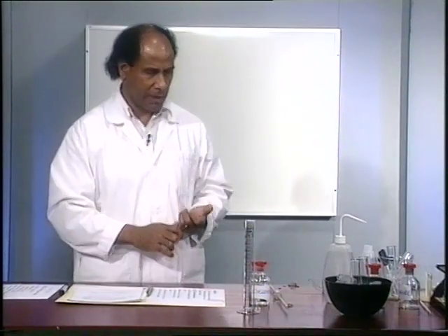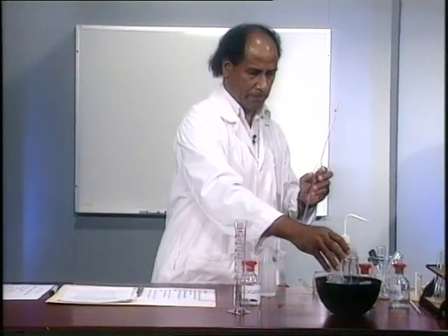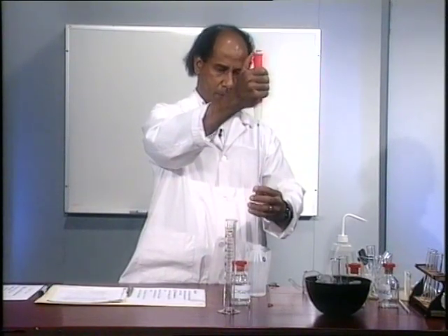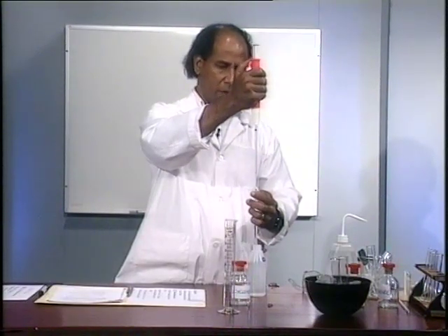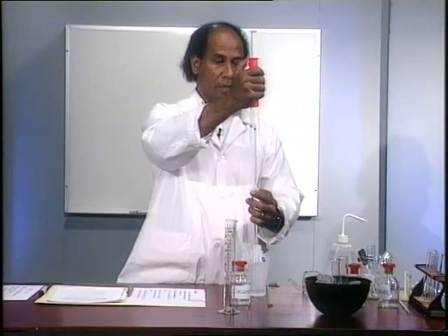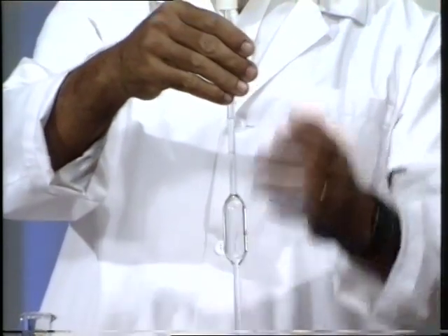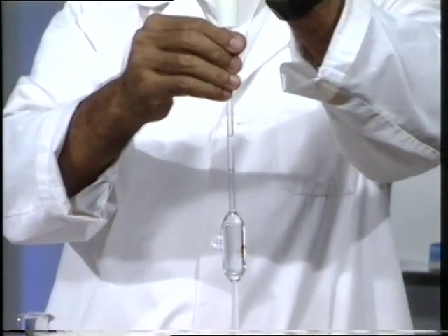And after you've done that, now I'd like to show you how to do that. Now it's very important here that you measure the volume accurately. That is why we are using a pipette. Sorry, not a measuring cylinder, a pipette. Now you'll notice that these pipette fillers are not very well designed, and they don't seem to work most of the time.